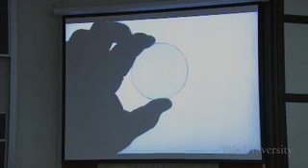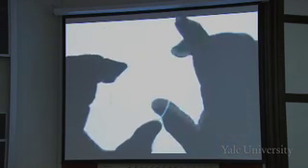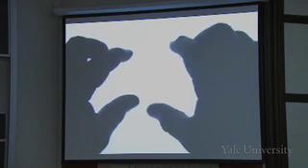They get very close to one another. But if I turn the top one over, you see that it's a little bit, so that's what we just saw. But notice that if I turn it over, there turns out here at the edge to be a little bit of a gap because the top one is just very slightly curved.